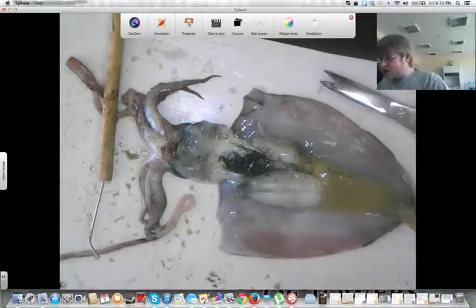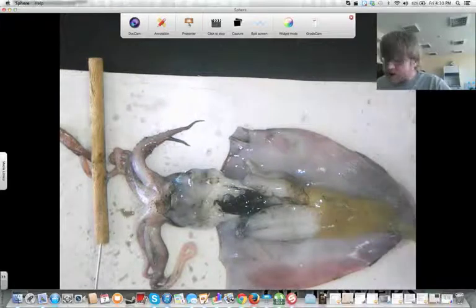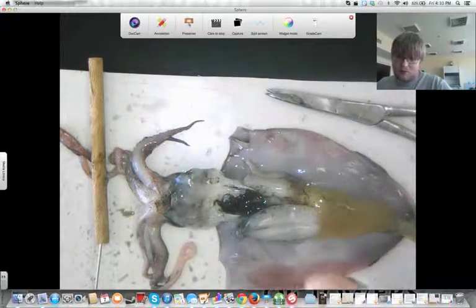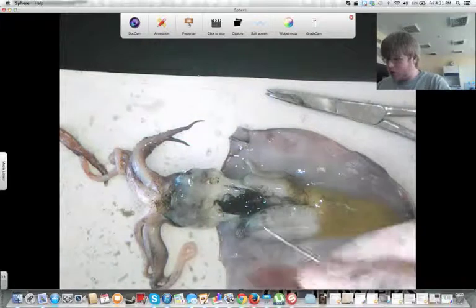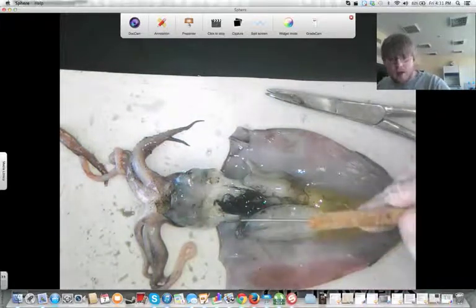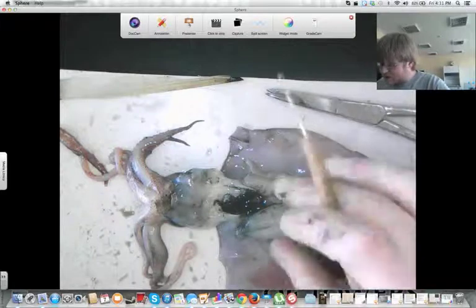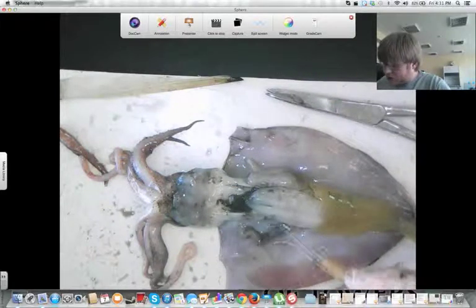Alright, so once you open up your squid, you'll see several things. Now, what I've actually done is I've cut open my siphon here, as well as punctured the ink sac. Do not do this right away. You can open up the siphon by hooking it with your probe. It'll be right along here, and then cutting it with your scissors. That's completely okay.